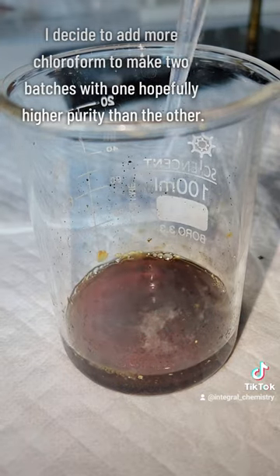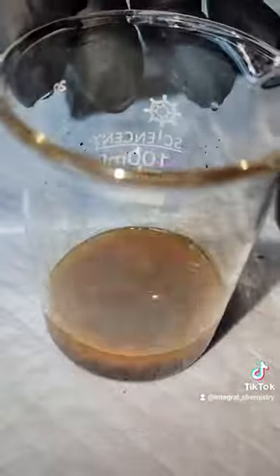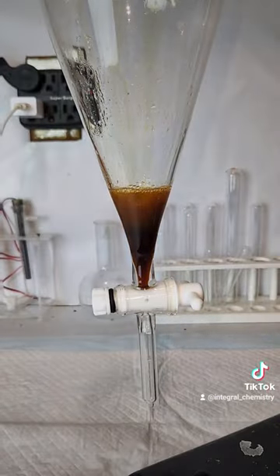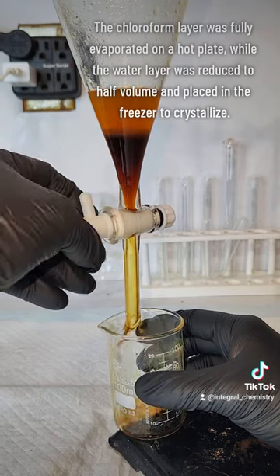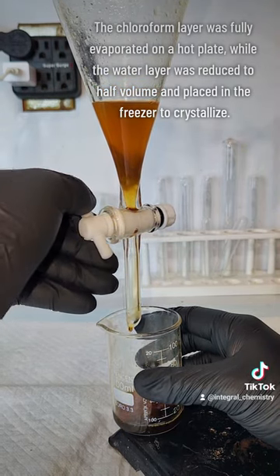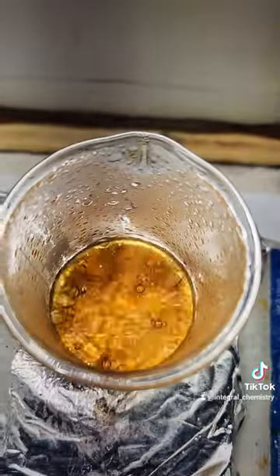My next idea was to add more chloroform and make two batches with one hopefully higher purity than the other. The idea here is that the chloroform would dissolve some of the caffeine but all of the organic contaminants, which would give me a dirtier product, and then the upper water layer when evaporated would crystallize and give me a smaller but purer product. To that end, I drained off the lower chloroform layer and dried off all the chloroform on the hot plate, and then I drained off the upper water layer and drove as much moisture as I could off on the hot plate.